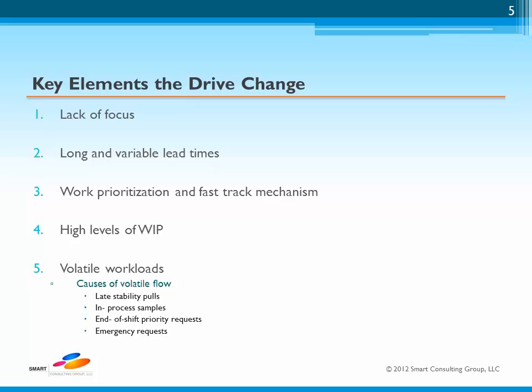The first of these is a lack of focus. There is often a lack of focus on the critical attributes associated with performing an analysis. Why is this? Frequently, there is a variable arrival time at the laboratory and a variable requirement for the type of analysis performed. This creates a variable load from a sample supply point of view and a variable processing time or cycle time for a given sample through the laboratory.